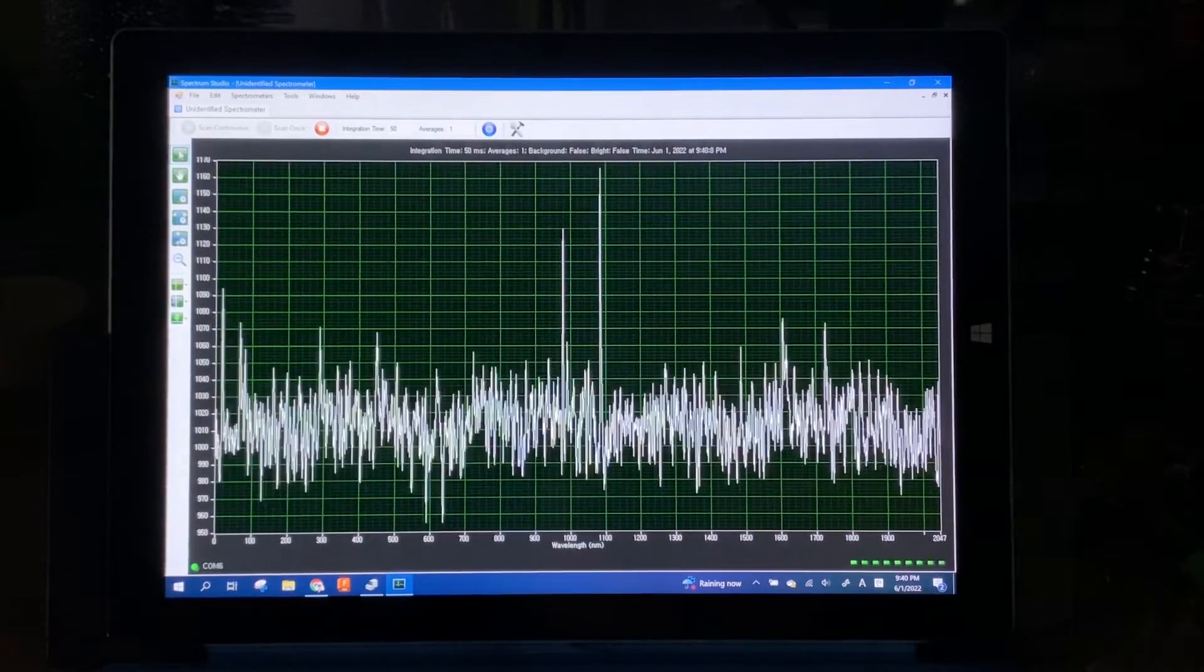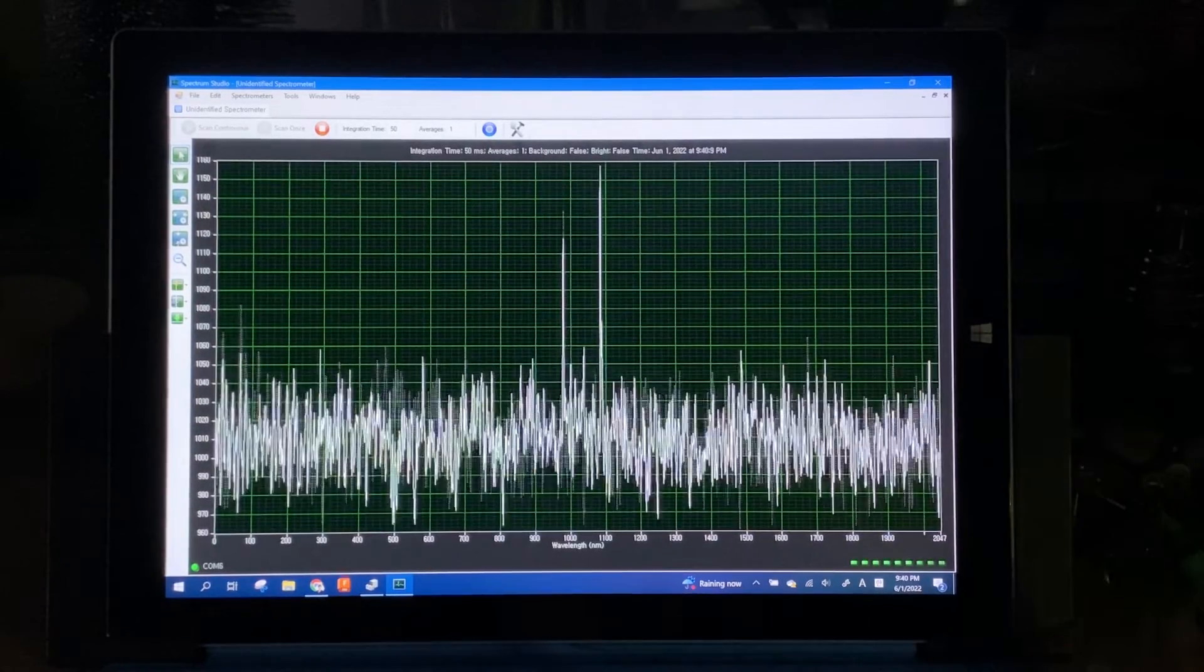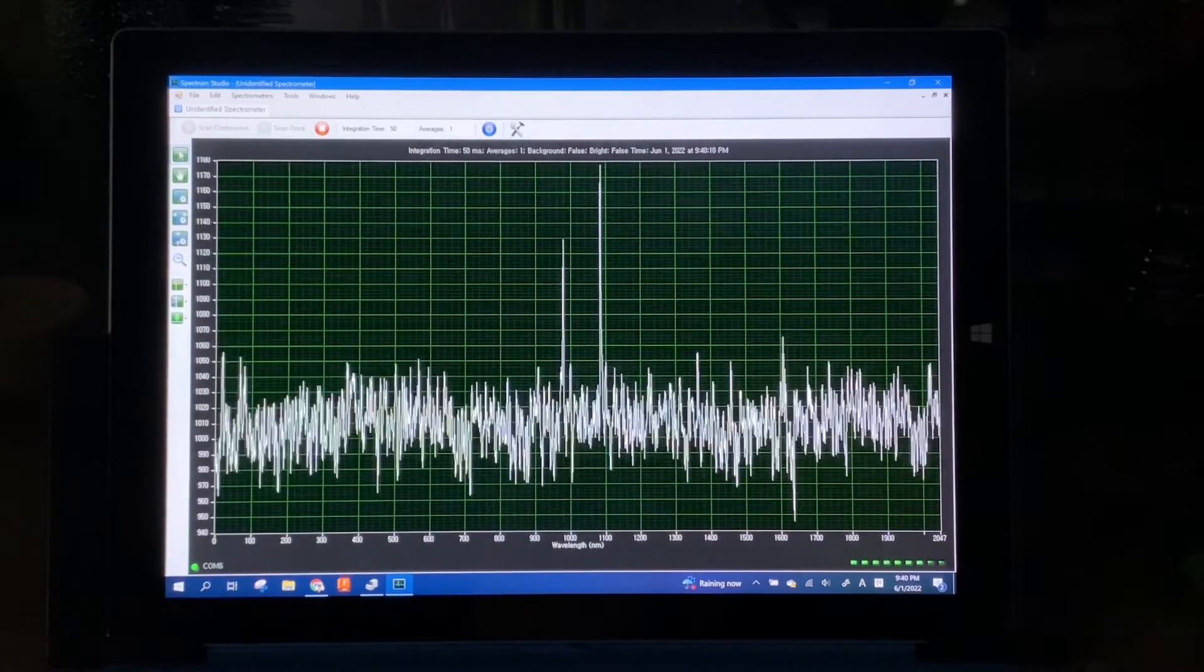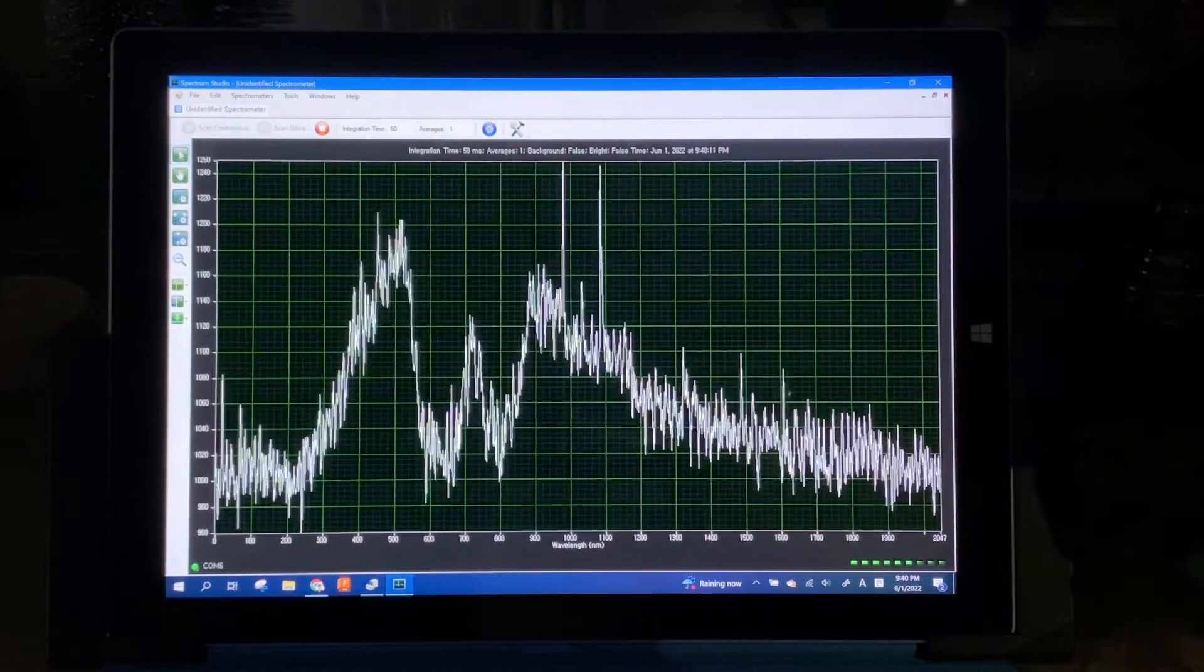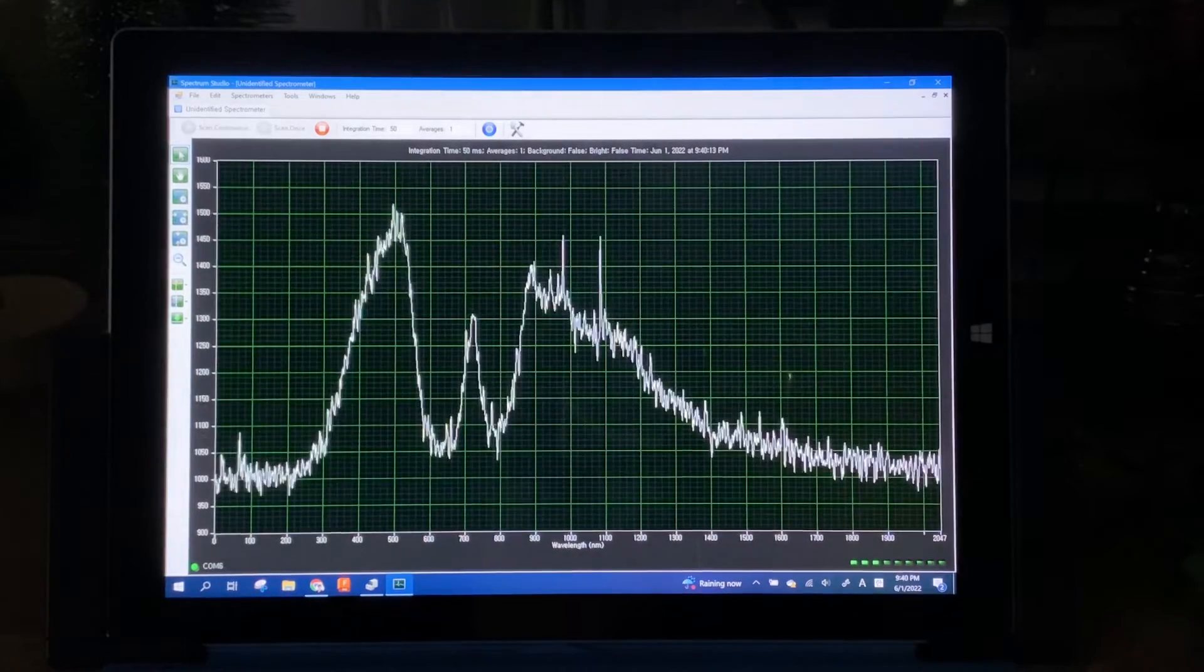Finally, this one is the white light from a cell phone, and this one also agrees to the known spectrum peaks.